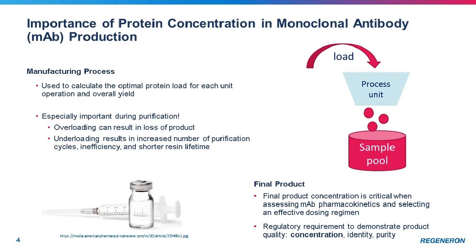In order to demonstrate product quality, we are required to demonstrate proper protein concentration, protein identity, and purity.